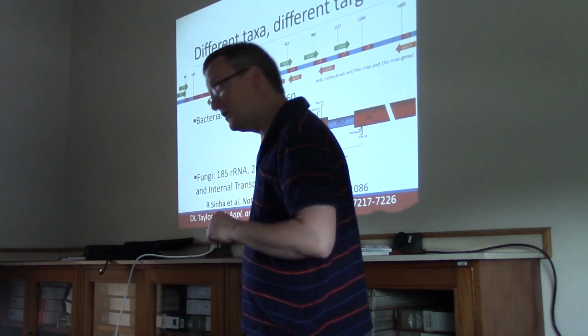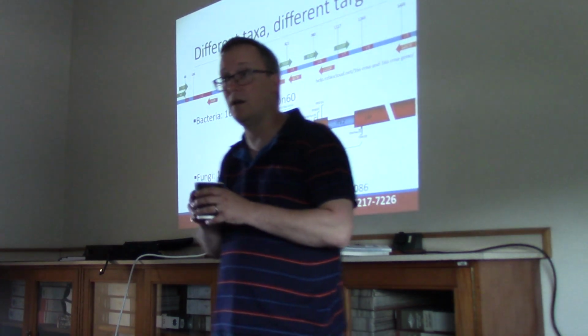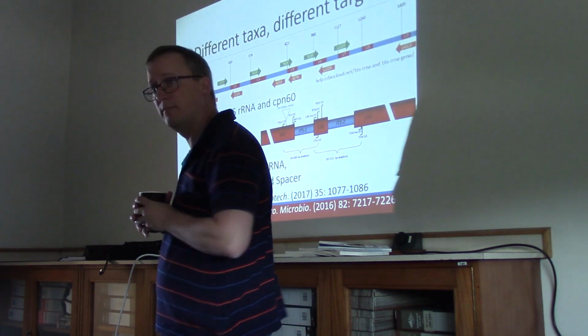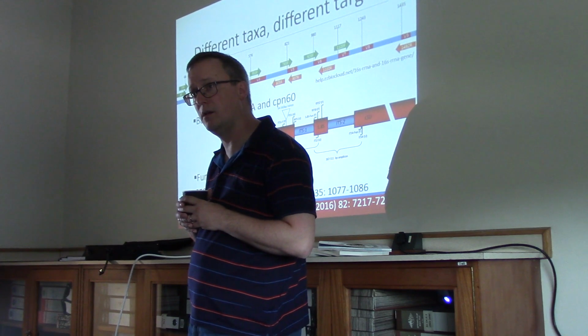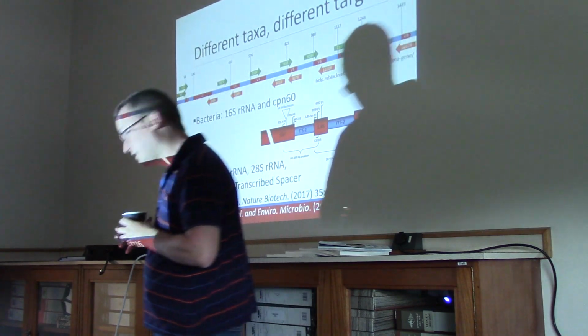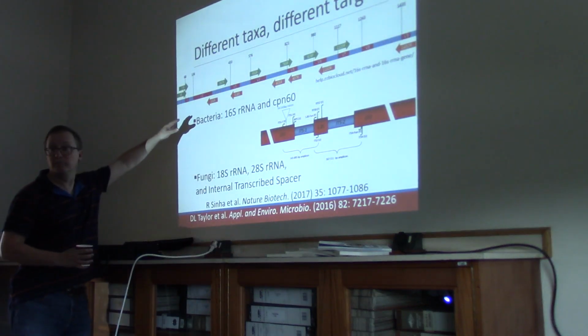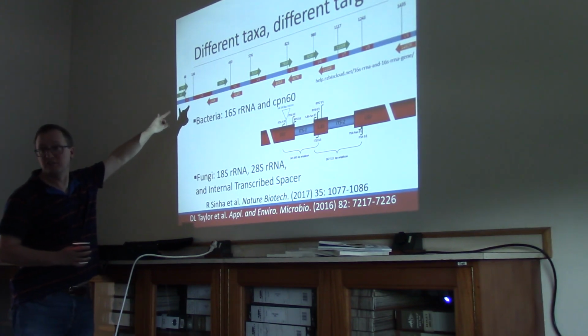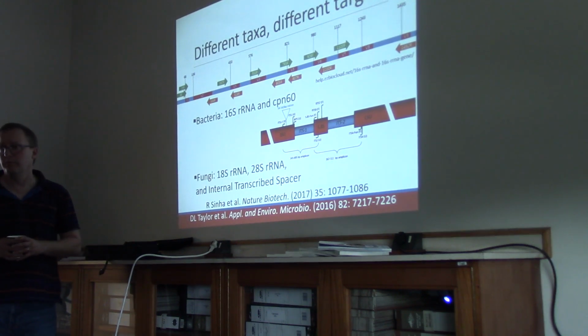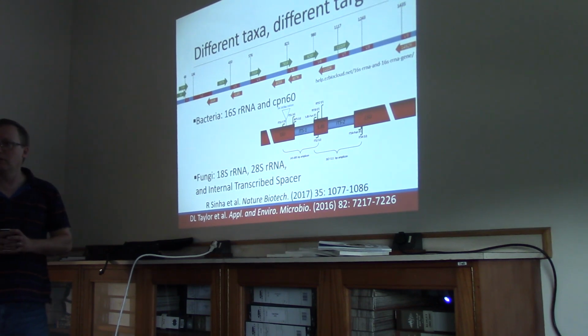Yes? So, I was told that if you are choosing primers, and you set your primers in this region, maybe between 68 and 136, or maybe 68 to 100, you are going to see the band when you amplify. If the fragment is too short, you might not even see it. They said it comes out between 3-something to 5.